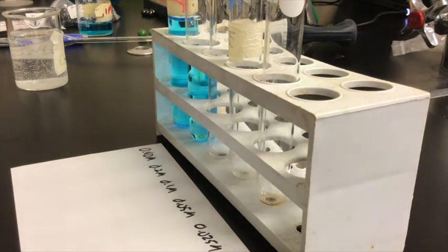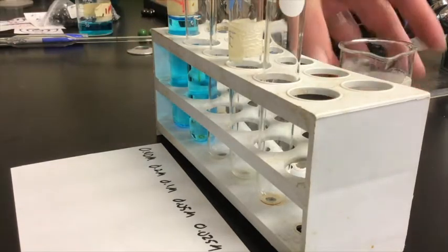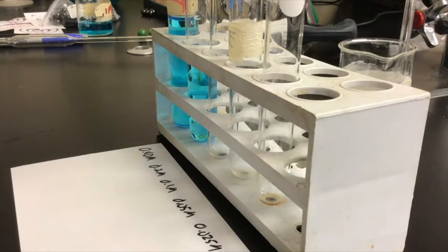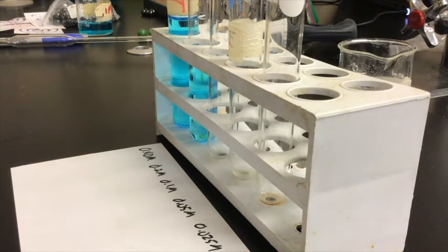Well, if I'm going to be cutting my molarity in half, then all I really need to do is add an equal amount of water. So if I take one of these and add 10 milliliters of water to this, like so, and get exactly 10 milliliters of water here.